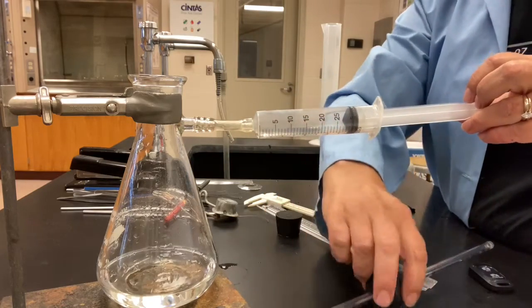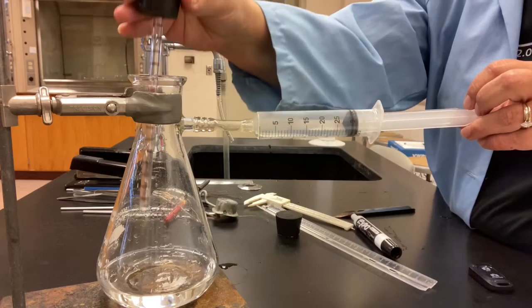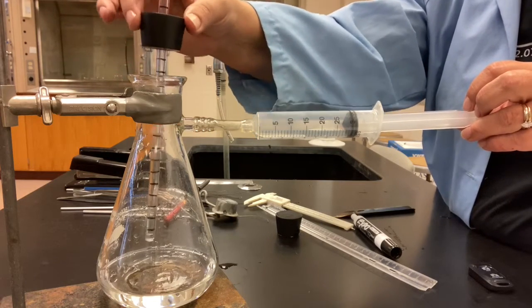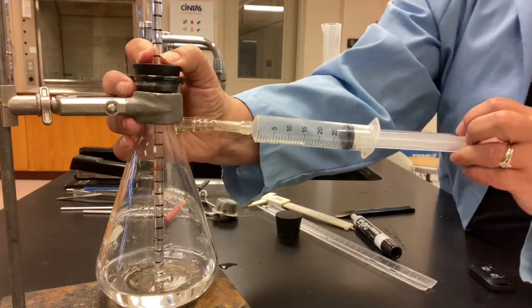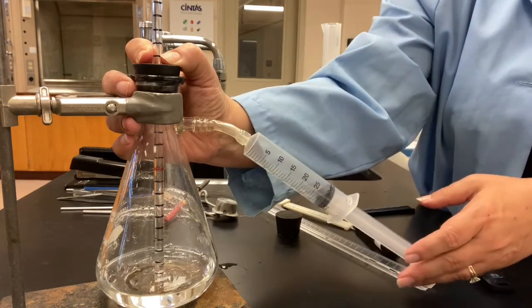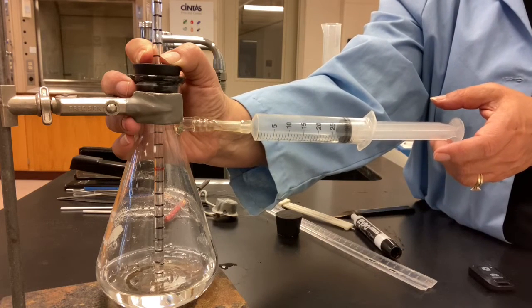Now, when I insert the tube, some of the liquid is going to go into the tube because now I'm going to decrease the volume by putting the cork into the tube. So some of the liquid will go right up into the tube, and I'm going to go ahead and read that. And that reading is 2 centimeters. So the column height C, when the syringe is at 30, is 2 centimeters.